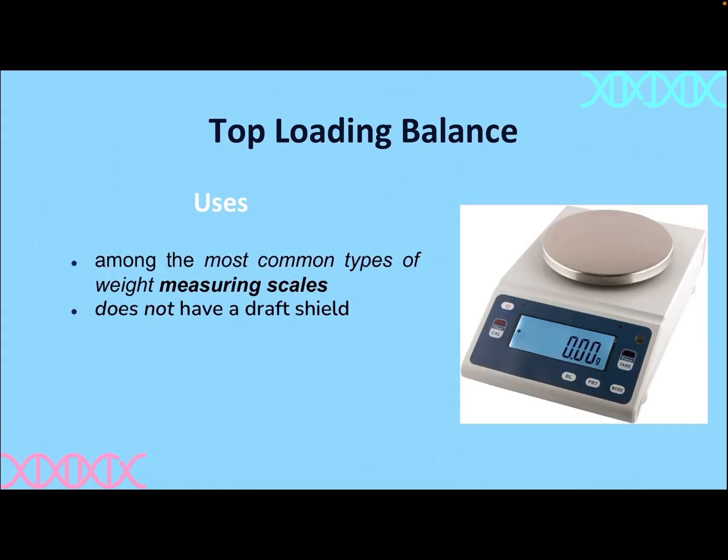Next is a top loading balance. It is among the most common types of weight measuring scales used in the laboratory. As compared to analytical balance, this balance does not have a draft shield. It is a balance with an open weighing pan loaded directly from the top.